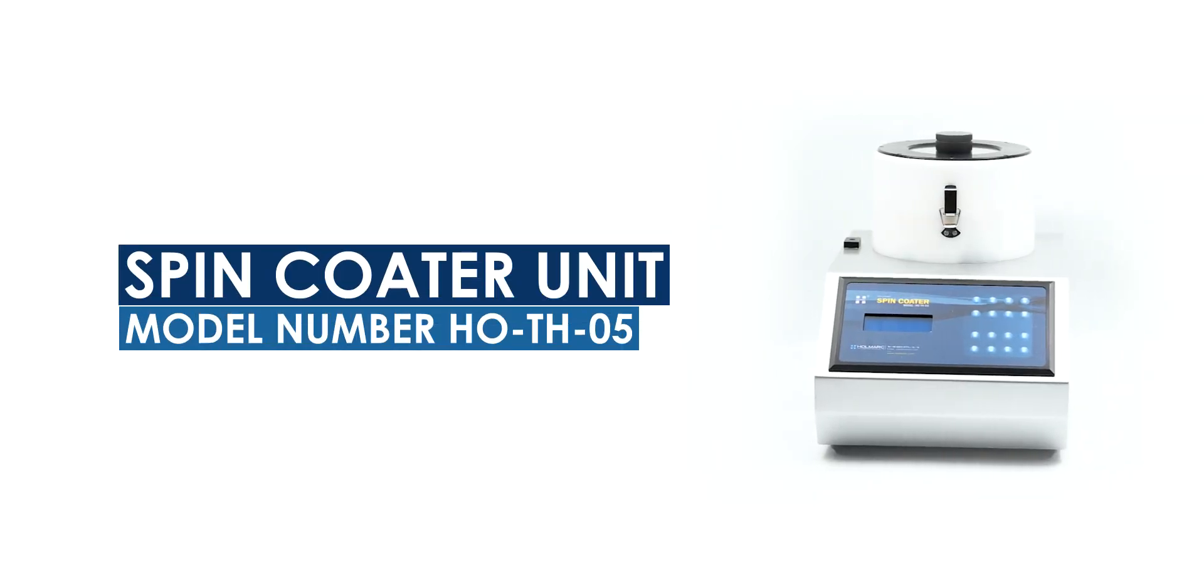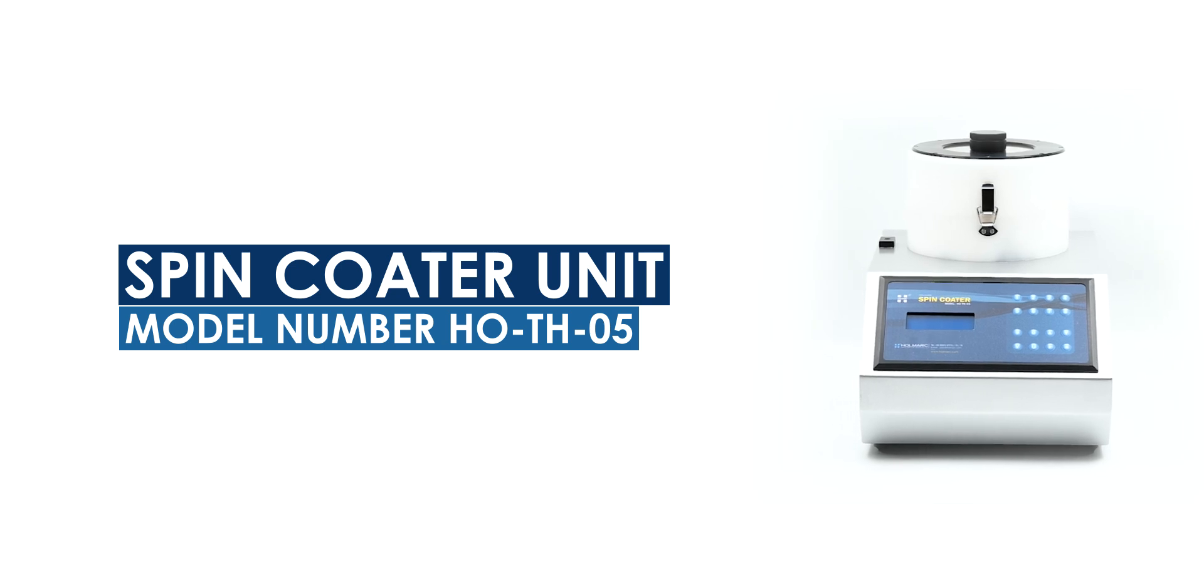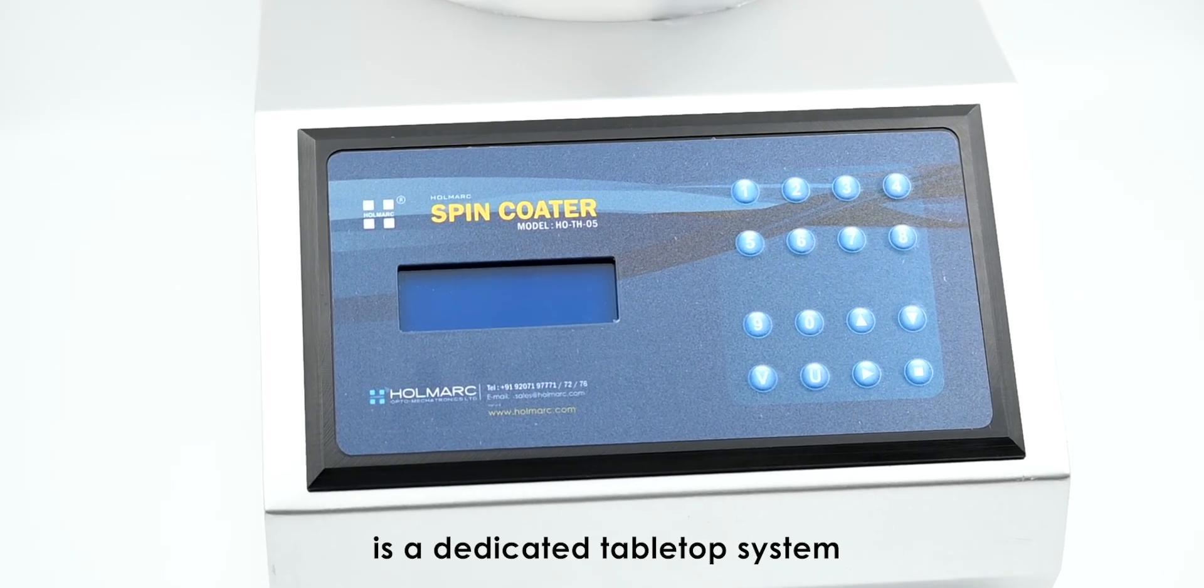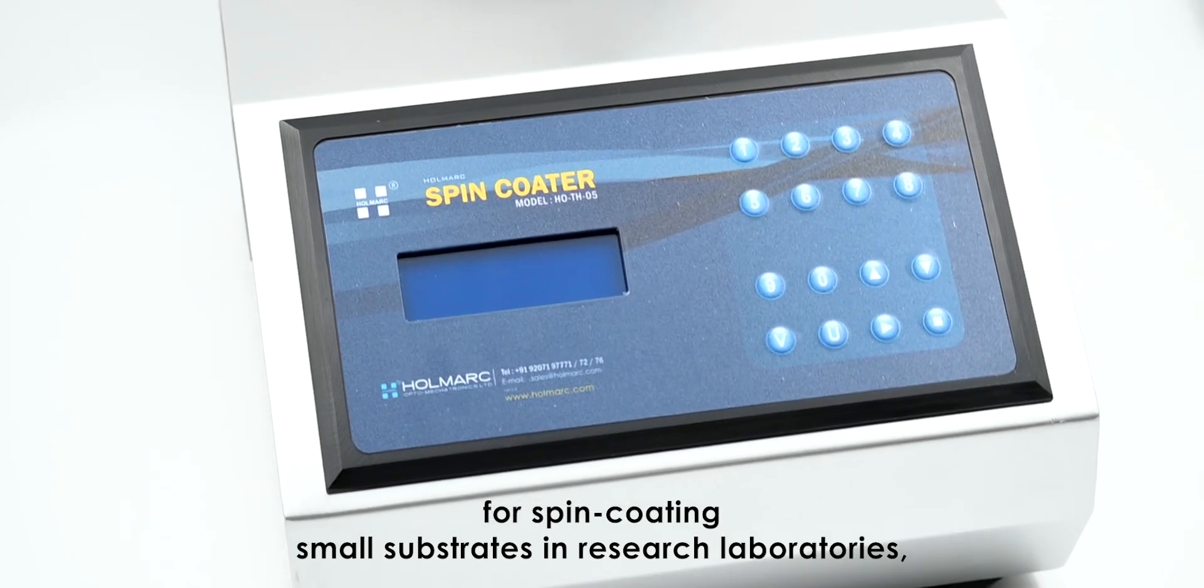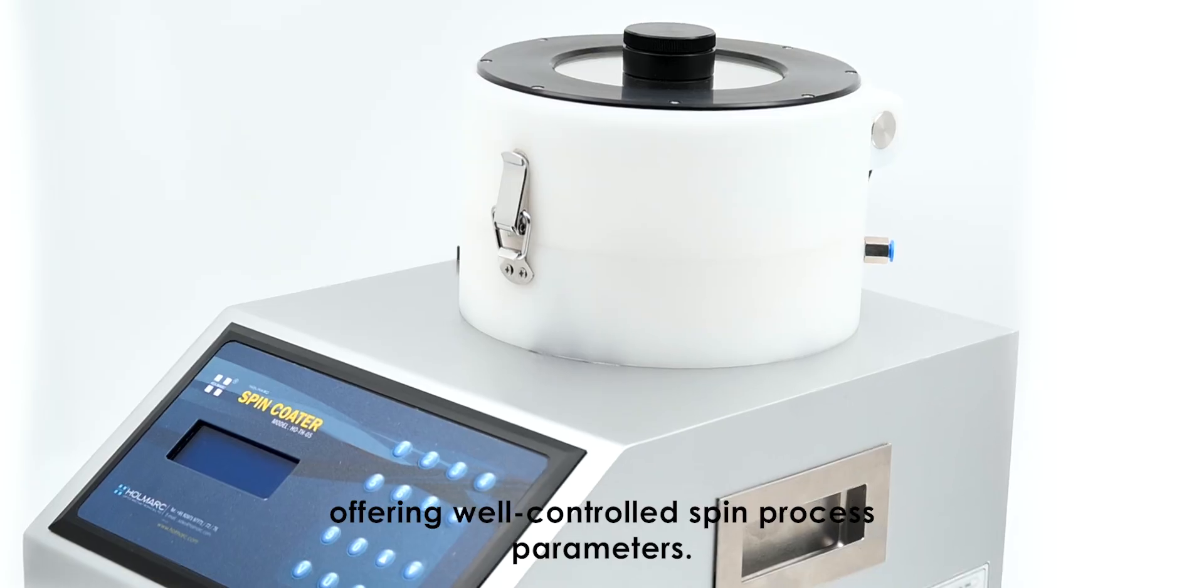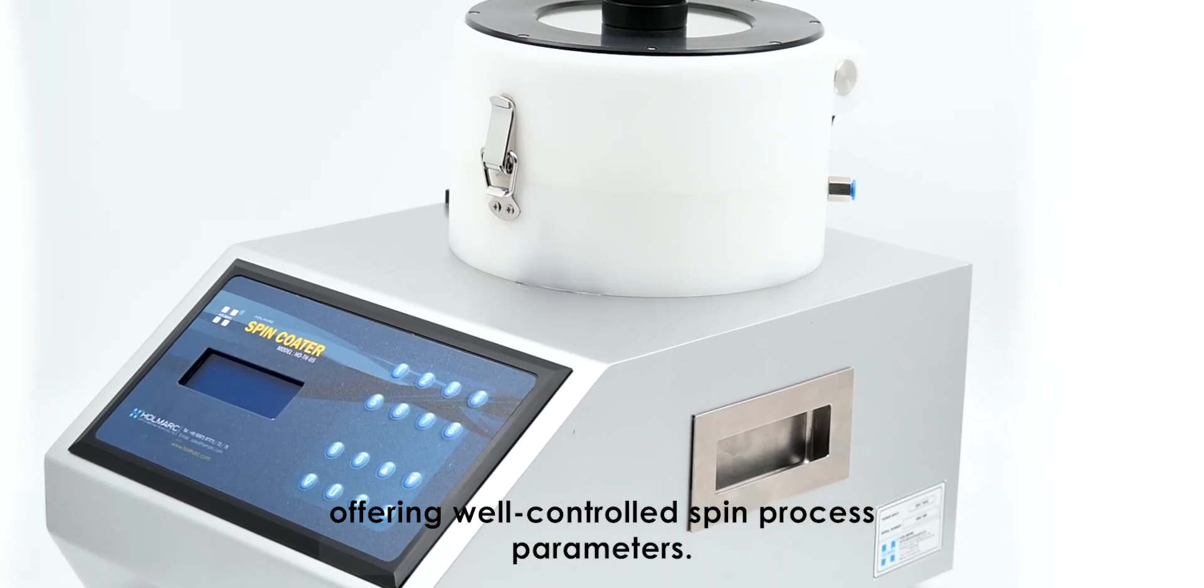Hallmark spin coater unit model number HOS TH05 is a dedicated table type system for spin coating small substrates in research laboratories, offering well-controlled spin process parameters.